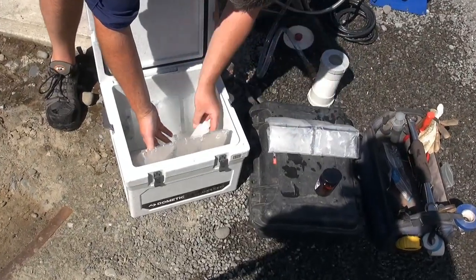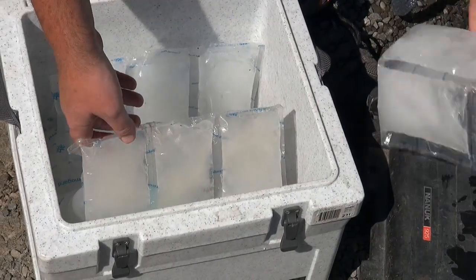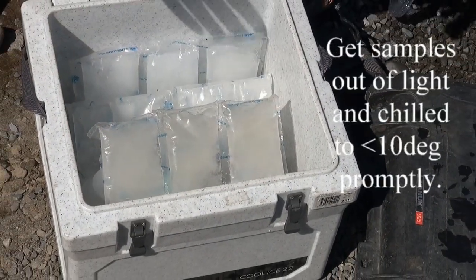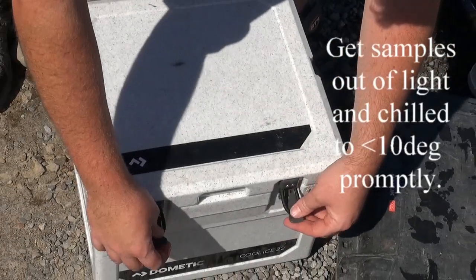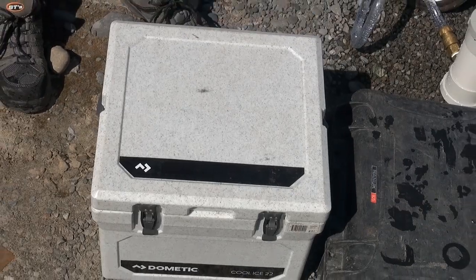Then we put them in the chilly bin for storage for the day. Make sure your chilly bin is the right size for the amount of samples you're going to collect. These ice gel packs are very good — they stay frozen for a lot longer than normal ice. A quality chilly bin is worth its weight in gold.